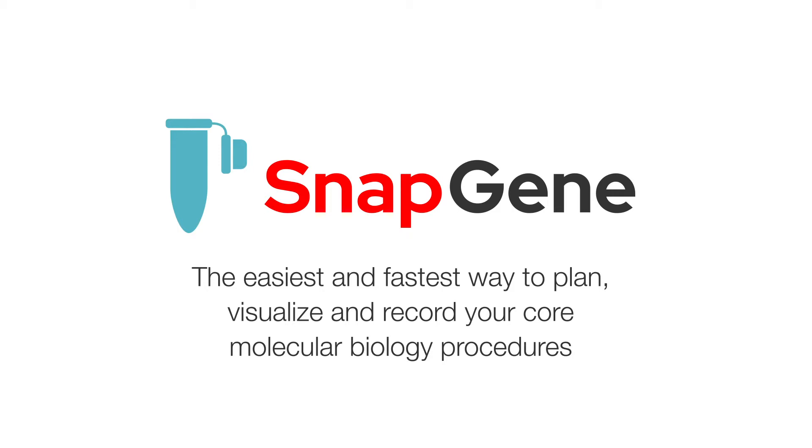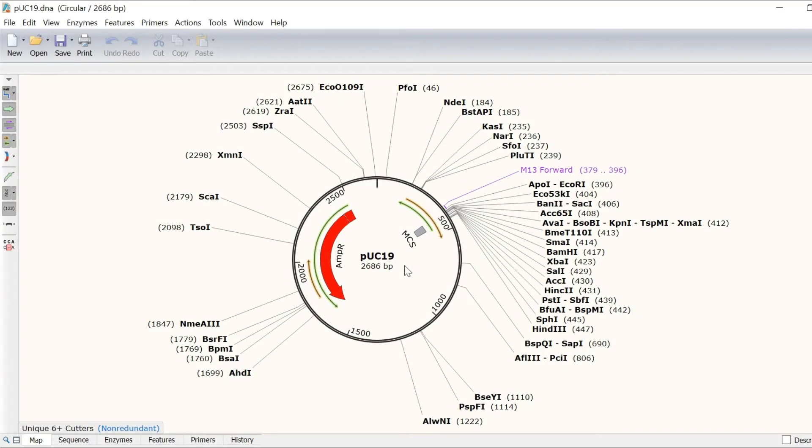Today, we're going to focus on features that help you visualise in Snapgene. So let's jump into it. First, let's take a look at the map view.